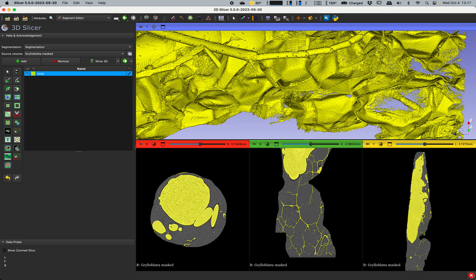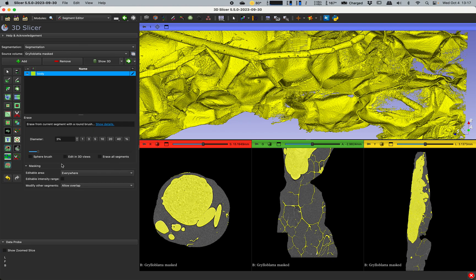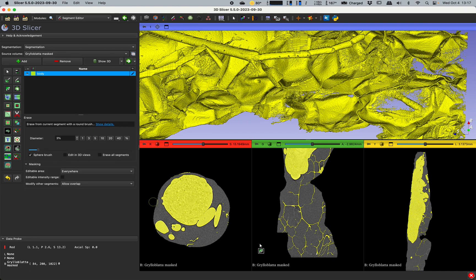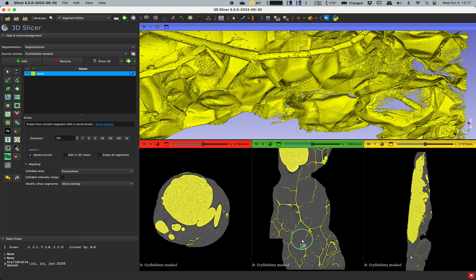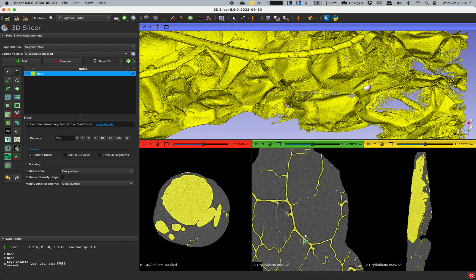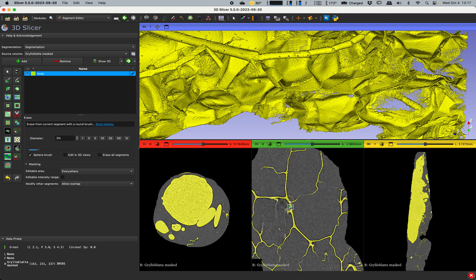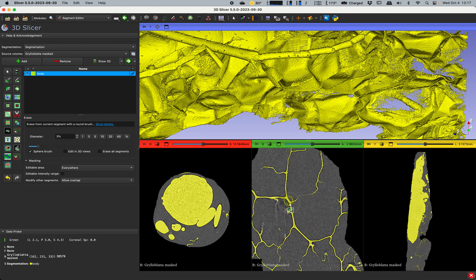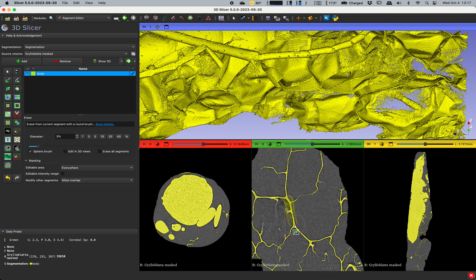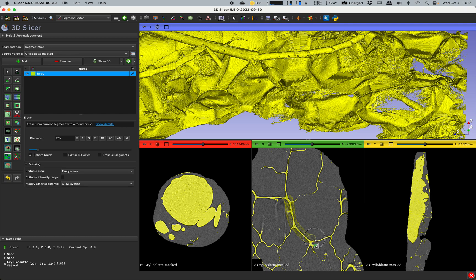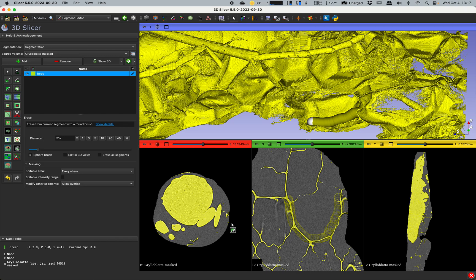Here it is. You can use a sphere brush, kind of go in here and erase some of this by hand. In the 3D view you can kind of see where you are erasing, which is handy.